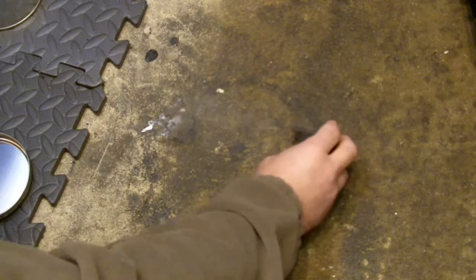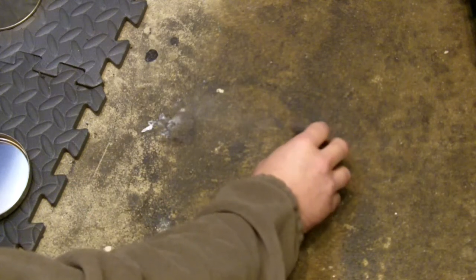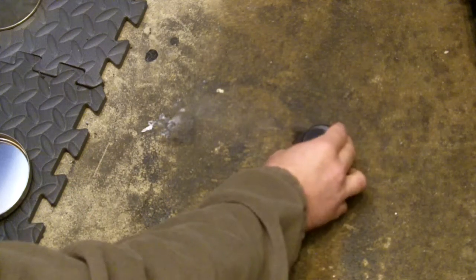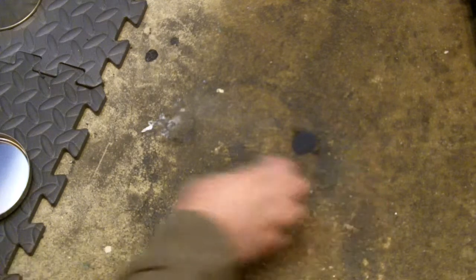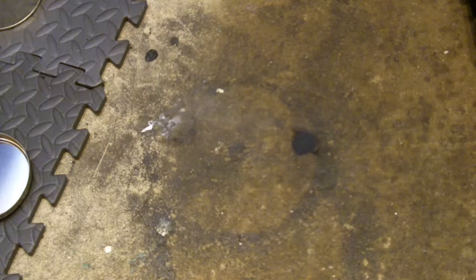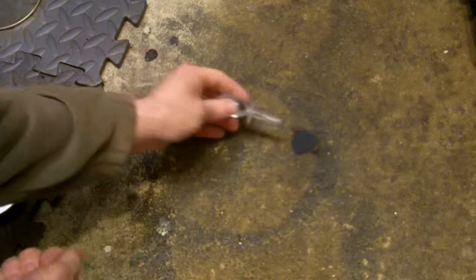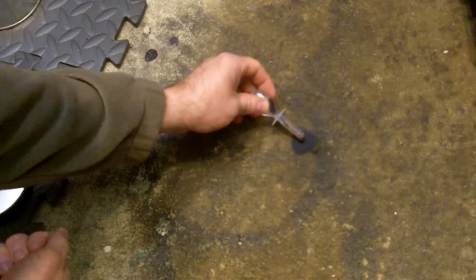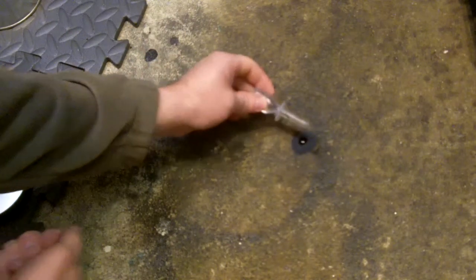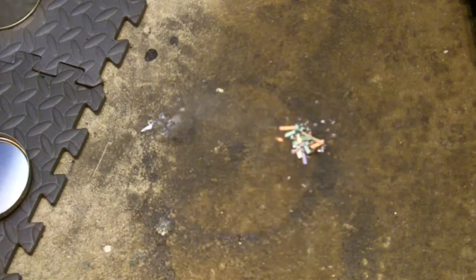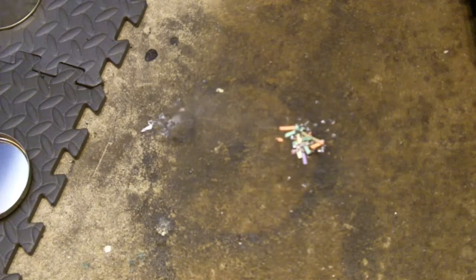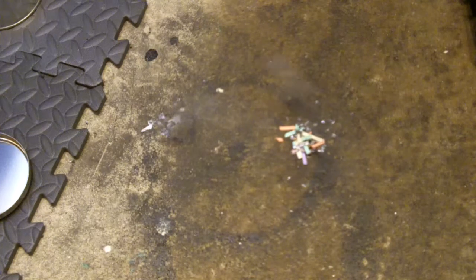All right, so potassium permanganate, flatten it out a little bit. It helps if there's a well in the center to catch the glycerin. And then this is a pile of magnesium strips and some paper strips.